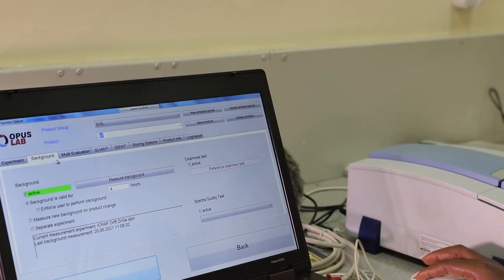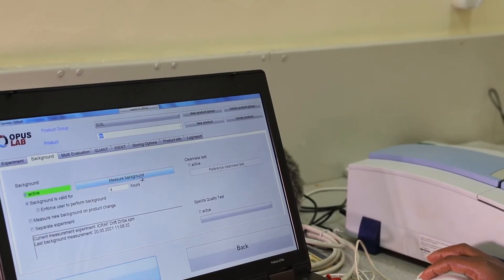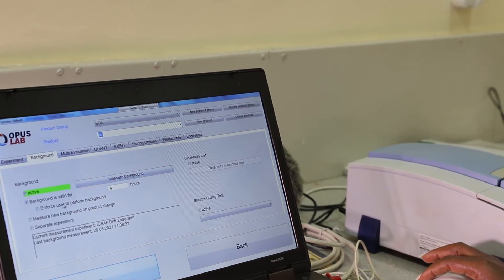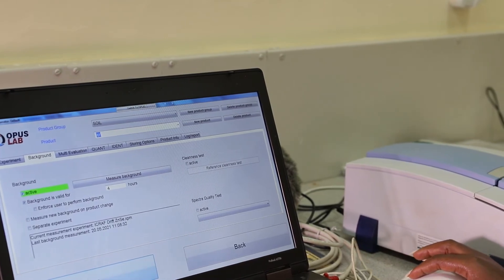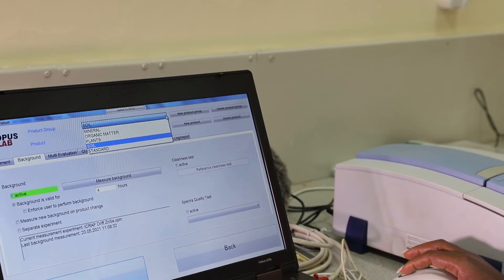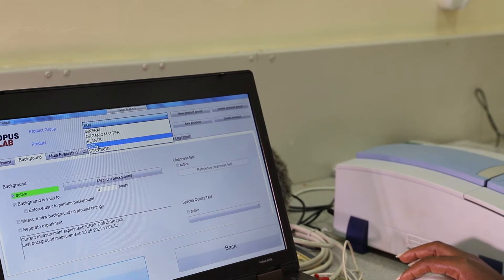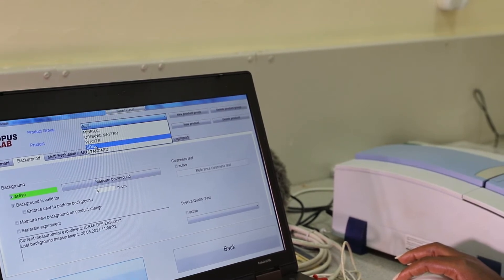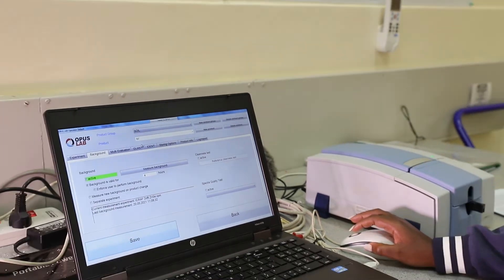On the Background icon, we normally measure the background, which is valid for four hours — that is why you can see it is active. We also have the Product Group, which can be soil, plant, or organic matter. You have to select the type of sample you are analyzing. For us, we are doing soils, so you click on Soil and then go to Save.